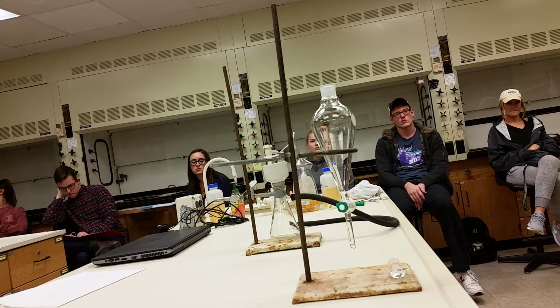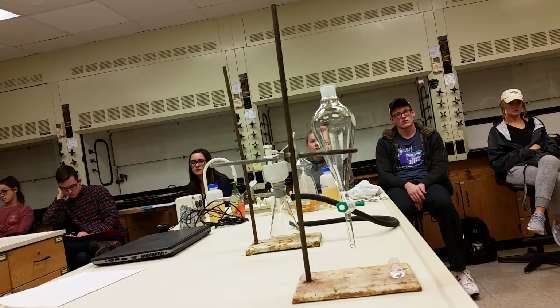You're going to put that into a beaker. Okay? Then you're going to add 10 milliliters of ethyl acetate. Ethyl acetate is an organic solvent. Because the compounds are organic, they will dissolve in the ethyl acetate. You'll then put them into a separatory funnel.